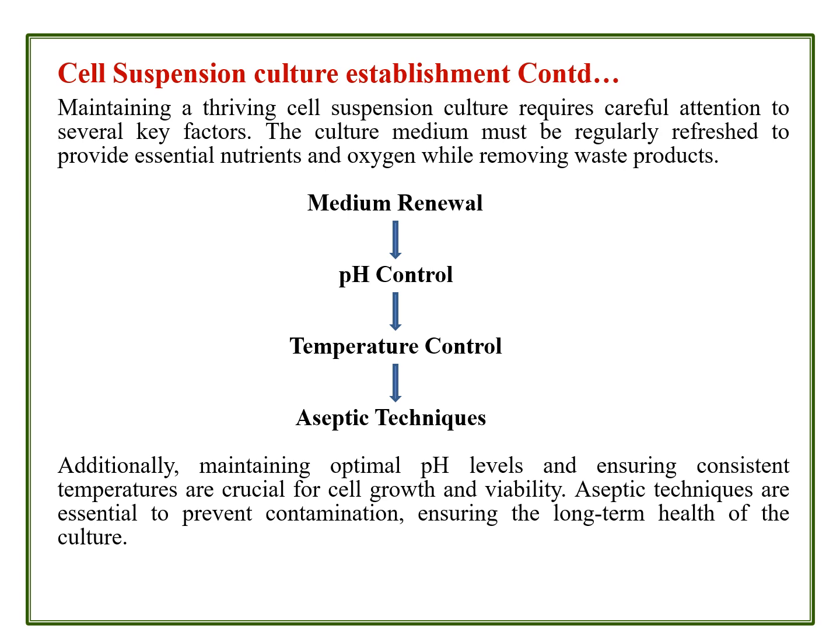So after inoculating the cell aggregates, the maintenance is somewhat difficult, but it is possible with cell suspension cultures. It requires careful attention to several key factors.